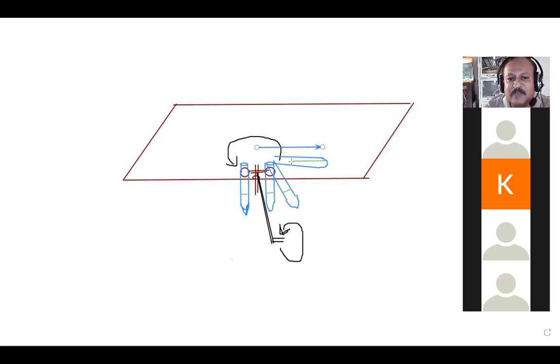The entire liquid is pushed to the bottom of the tube. And if there is particulate matter, then those particles would go to the bottom of the tube. Can you imagine this situation?